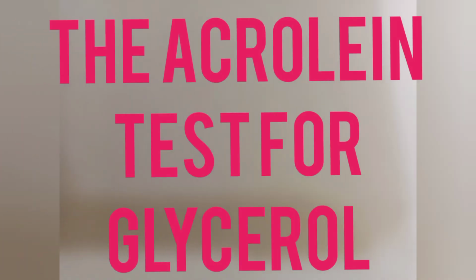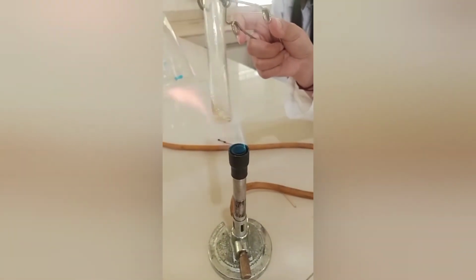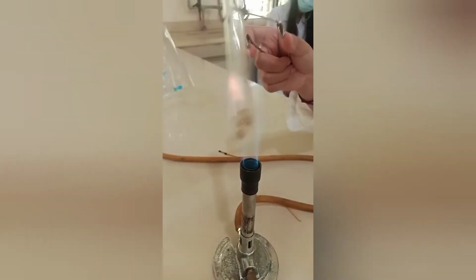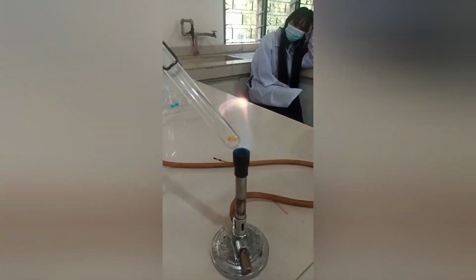For the acrolein test for glycerol, first, place 1 gram of potassium hydrogen sulfate in each of 7 test tubes and label them. Our first test tube contains potassium hydrogen sulfate and cholesterol. Our second test tube contains potassium hydrogen sulfate and lecithin.